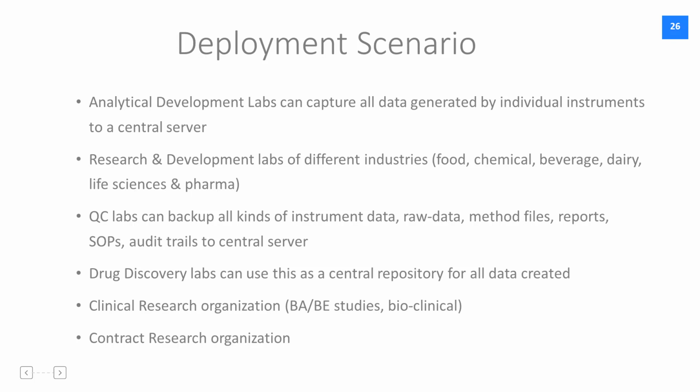Clinical research organizations who are doing BA/BE studies and bioclinical studies can store all their data in the SDMS system, and contract research organizations as well can store all their data and metadata such that their customers also have access to the raw and metadata at any point in time.